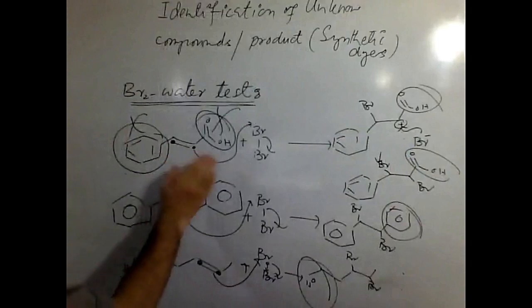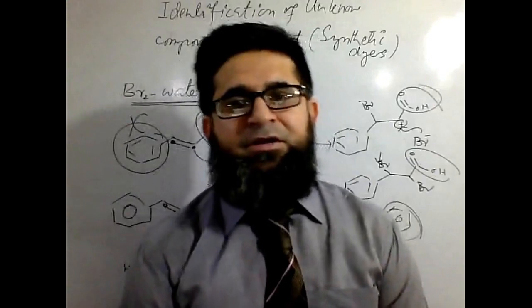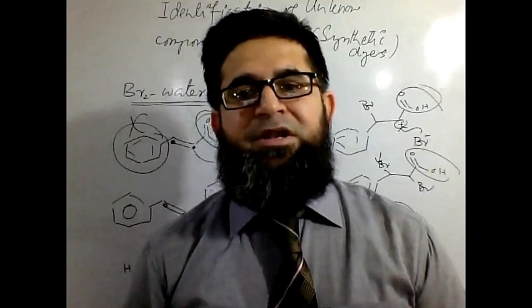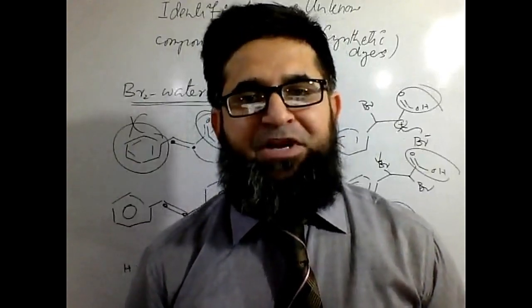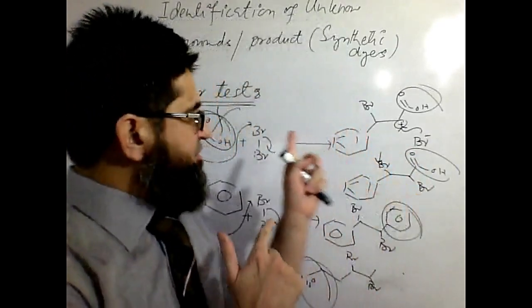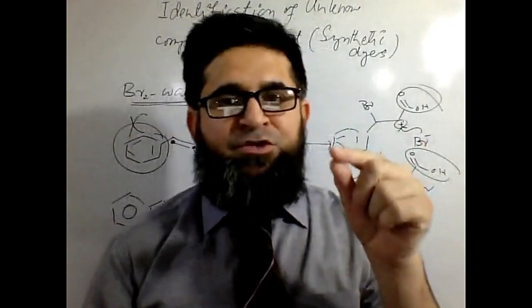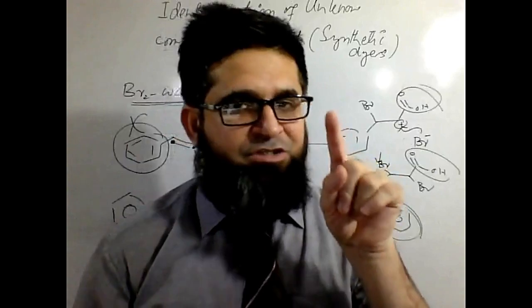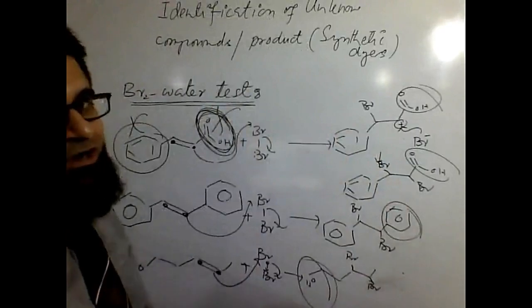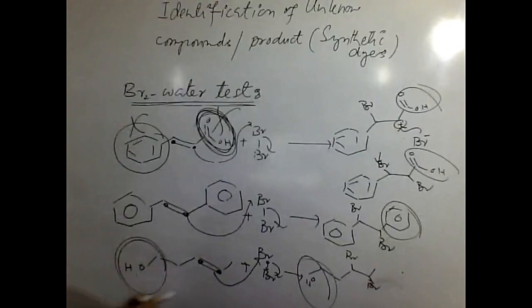Let's say in this molecule, the presence of carboxylic acid functionality is definitely going to be confirmed initially by the litmus solution, as it will detect the presence of acid. Then further, due to this carboxylic acid functionality, it will be confirmed by the sodium bicarbonate test, because that test specifically acts at this site, so it will be confirmed by that. Similarly, in this molecule, it's an alcohol.